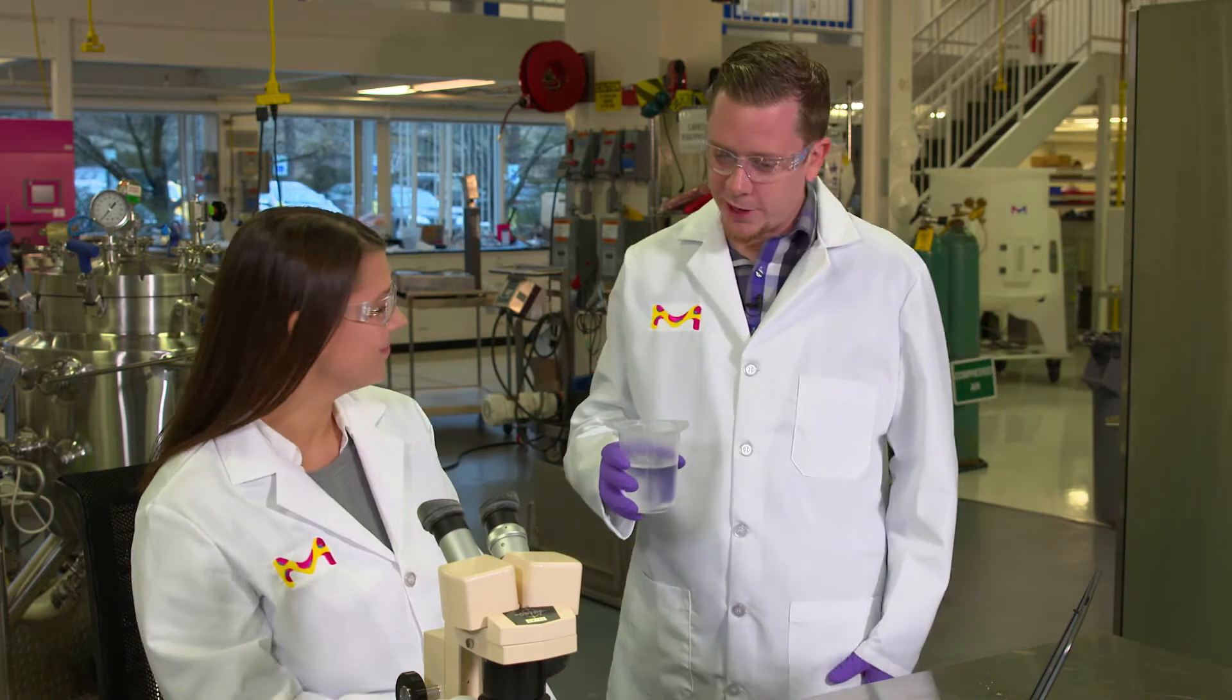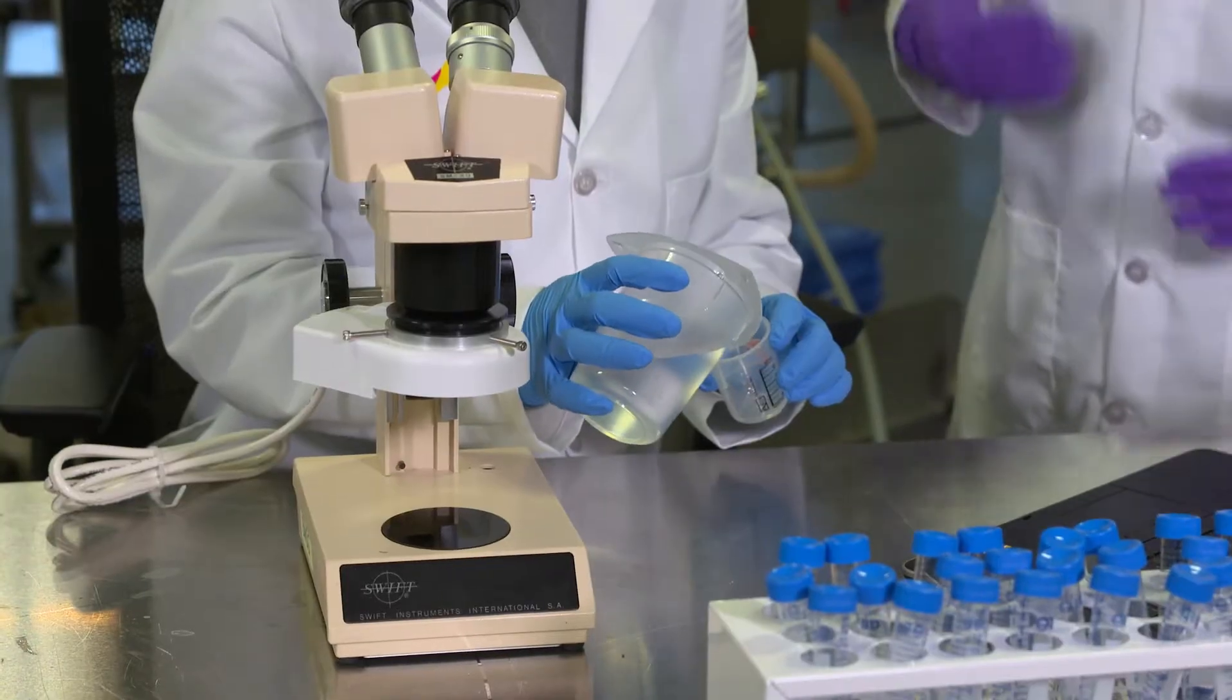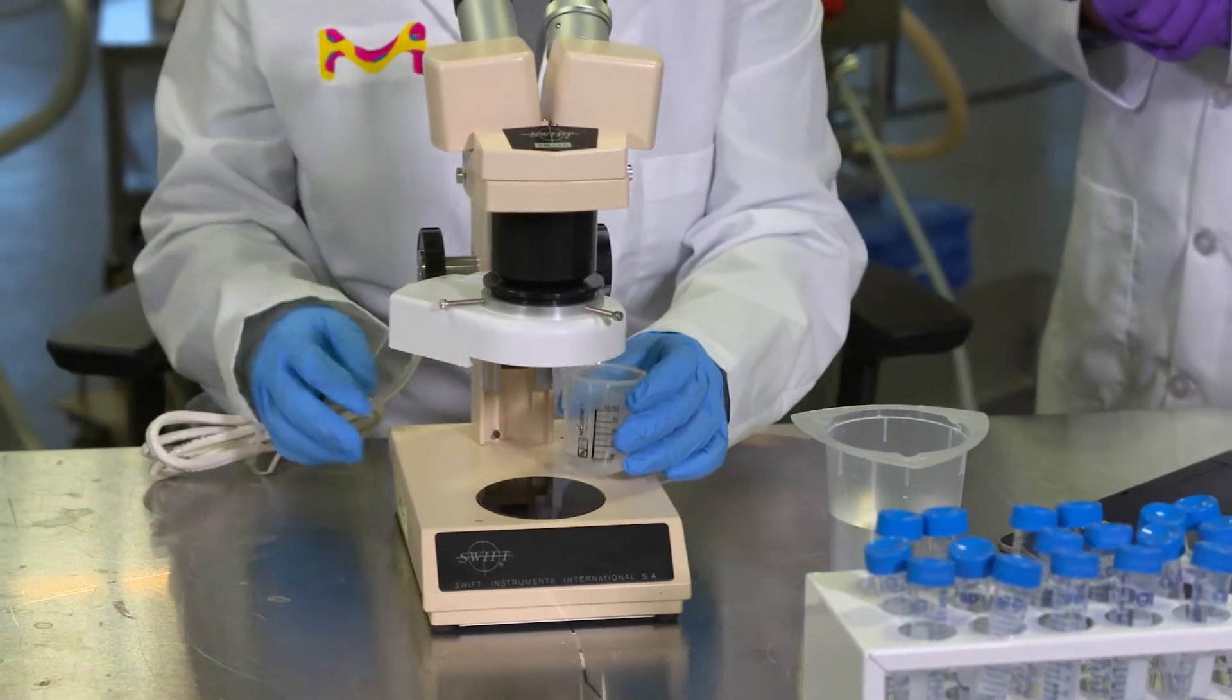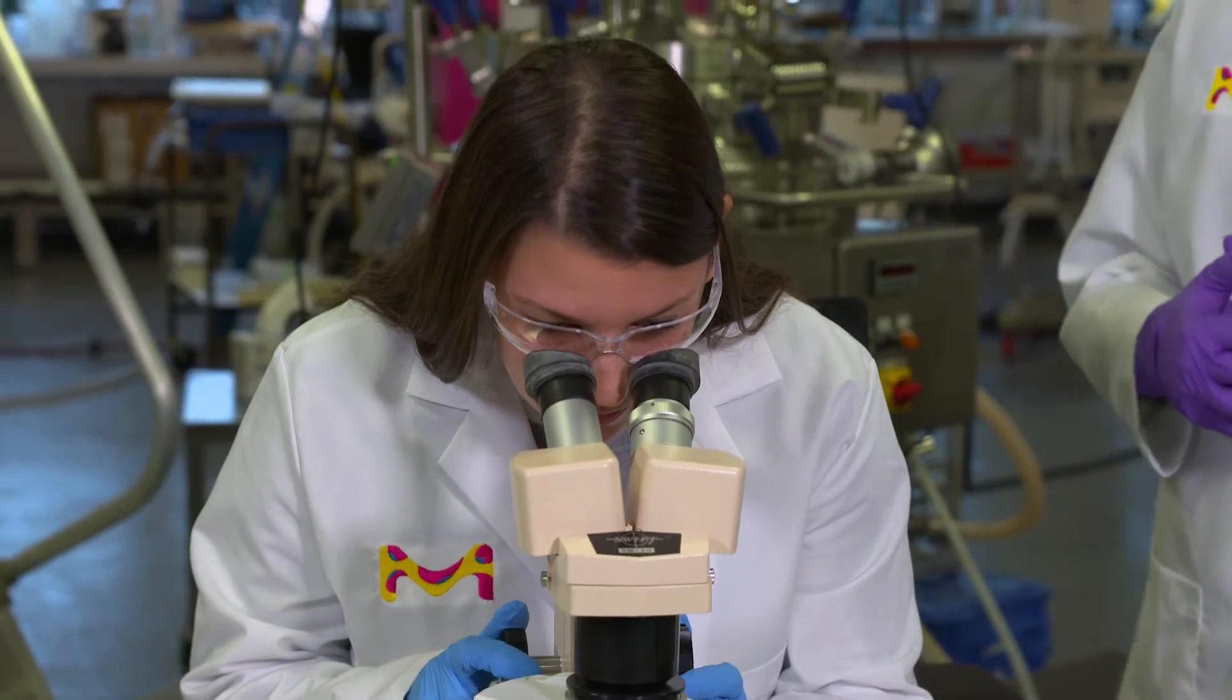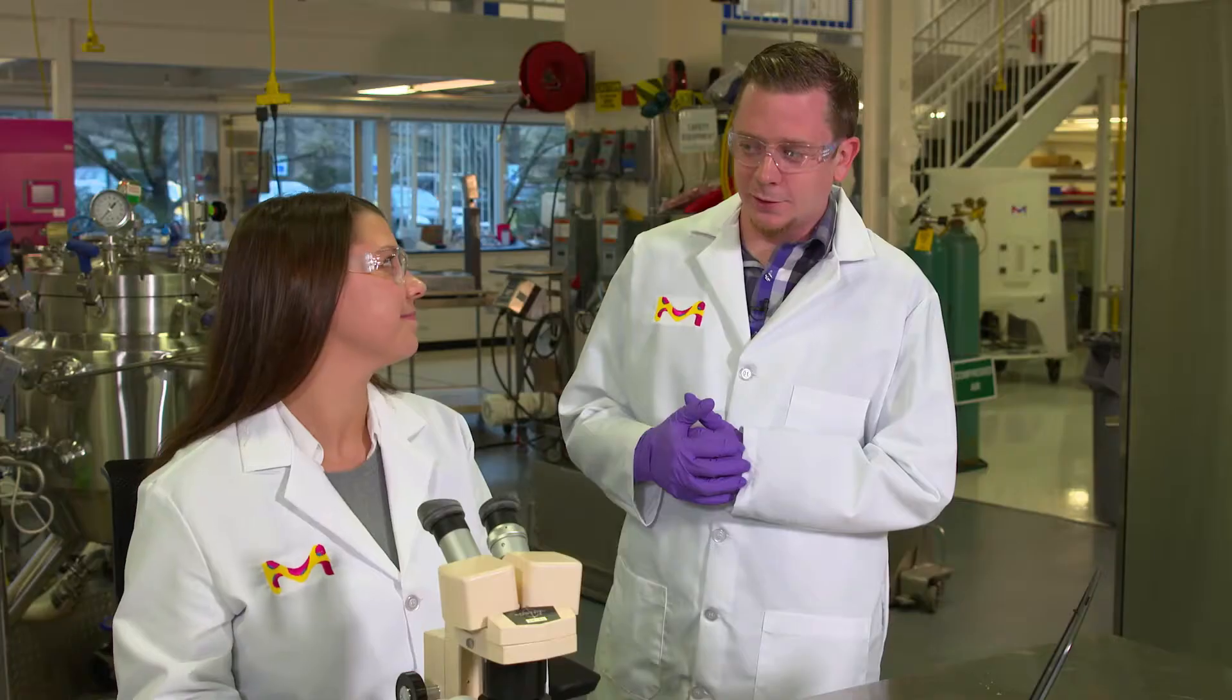Hi Ashley, do you think you could analyze the sample for me? Thank you. So the problem would be that if we do have a contamination, we don't know if it's the sample itself or the drinking water. It's contaminated?